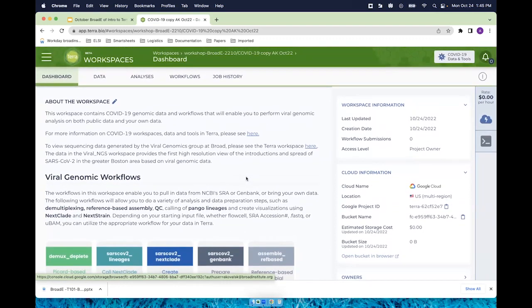One final note I'll add for now, because I imagine the question came up for a lot of folks: when you were cloning, the module asks you what bucket location you want. By default, we have US Central 1 selected, and we recommend sticking with that for now if you don't have any specific region you want to put it in.